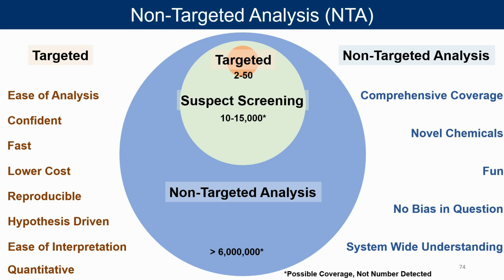And so we have to be very careful when we're reporting chemicals that we've just discovered that haven't been discovered before, that we then follow up with a targeted approach. If this compound is very important and it's going to be brought down into regulation or something where there's going to be a lot of emphasis on this chemical compound, we then need to synthesize that chemical and do a targeted approach to get the exact amount of it and validate what it is.